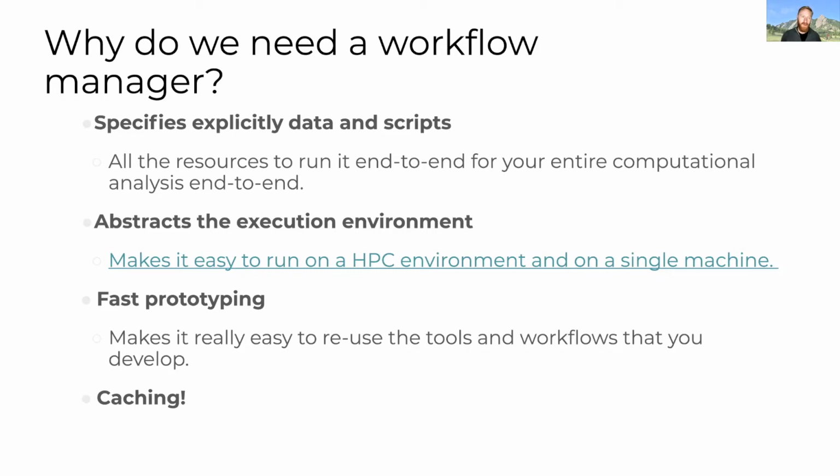Another really nice feature of Nextflow is that there is caching at every step of the pipeline, which means that if you need to rerun the analysis for some reason with new data, you don't have to start all over again. It will basically check to see which files need to be recomputed and which have not changed, so you can just use the cached version, which really speeds things up when some of these workflows take multiple days or weeks to run.